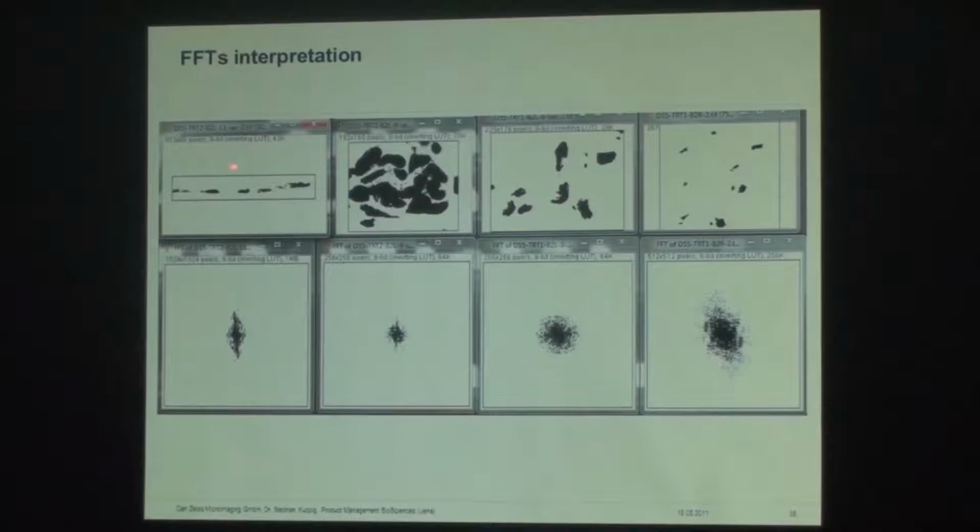Okay, as you can see here, these are all nuclei from an experiment where there are different shapes and all kinds of distribution and pattern. So these are the actual FFTs. When you look at these 4 FFTs, they give you some information about these 4 images. Number 1, for example, looking at the distribution of the frequency, the first thing you can see is, before we go into that, always in FFT, the low frequency information is very close to the center. The high frequency information is away from the center. If you remember that, it will be more helpful.